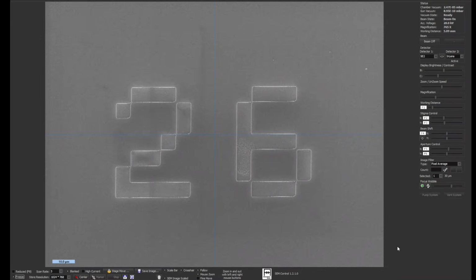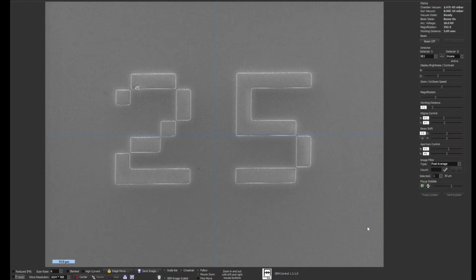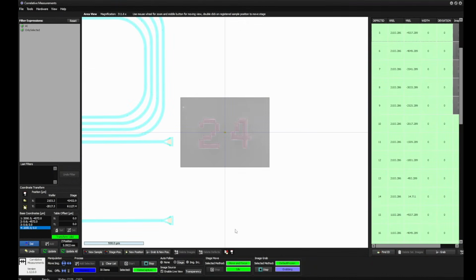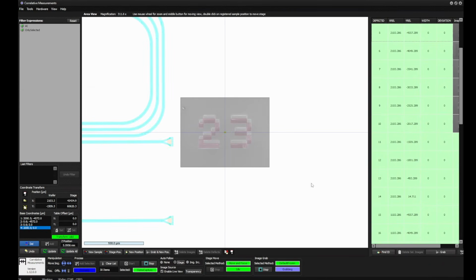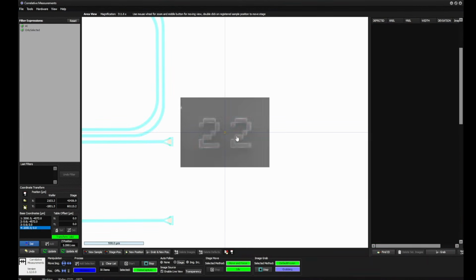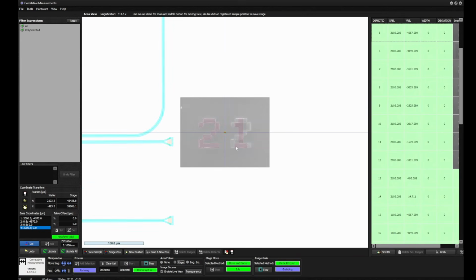And you can see it just captures the images. We can follow this here when we go to follow mode. This goes relatively fast. You can also see that there now is a shift, sometimes larger or smaller, between the GDS structure and the captured image.